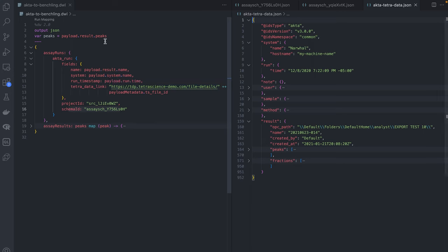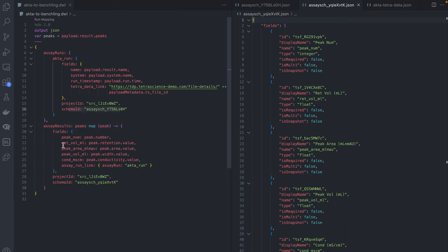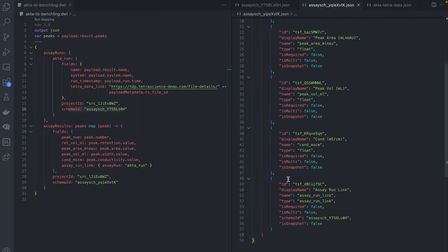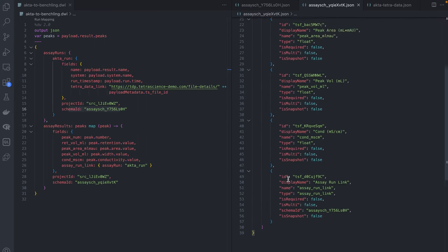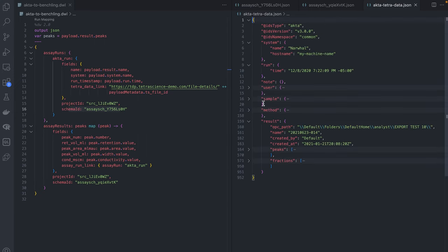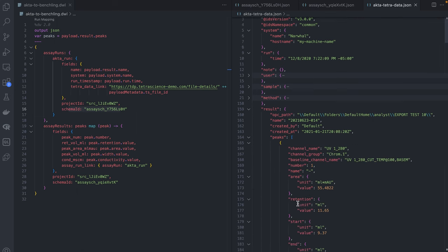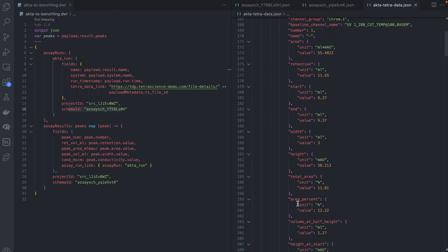Now let's look at the assay results. You'll see a similar structure here. Our result schema contains peak specific information, so we want run result per peak. We extract the peaks list from the Tetra data and map each relevant peak property to the corresponding Benchling assay result schema field.